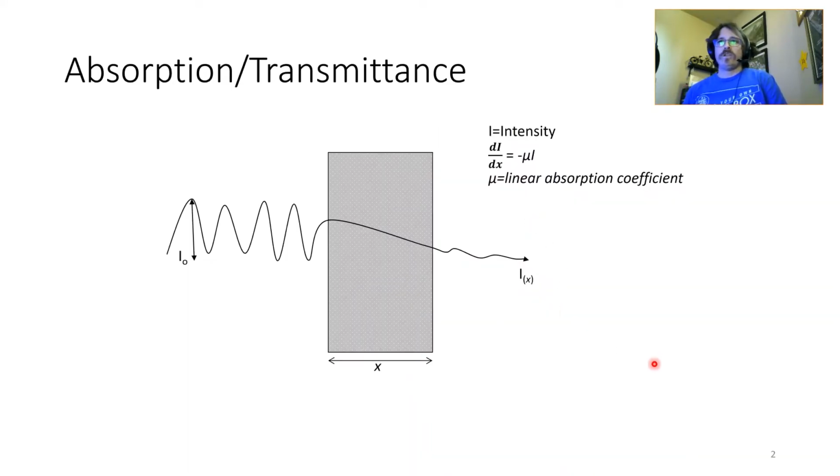Right now we're going to talk about absorption and transmittance, and we're going to talk about the attenuation of X-rays. This becomes pertinent particularly when you're talking about X-ray shielding, and if you're also doing pass-through filters. And so we'll talk about this in great length.